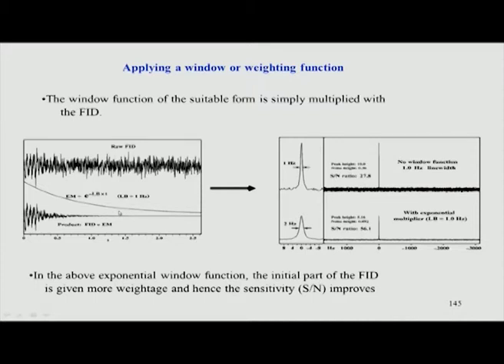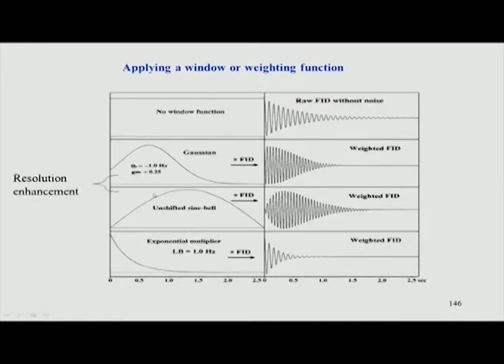Again, in today's spectrometers, these are done automatically by typing some commands. So, most of the users or students are not aware of what is happening behind the screen. Therefore, this slide is basically meant to show you what happens when you process the data. There are different ways to apodize the signal. You can take only the first part of the signal, or you can multiply with different functions, which are called window functions, and based on that we can do the processing.